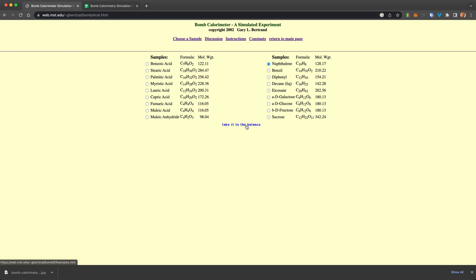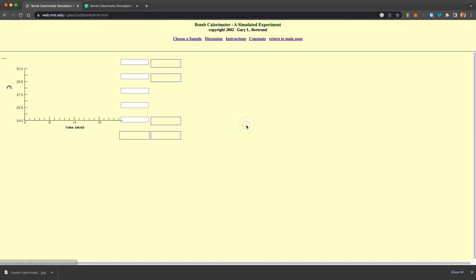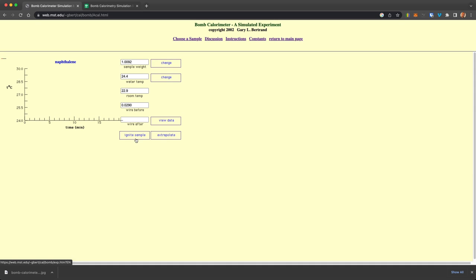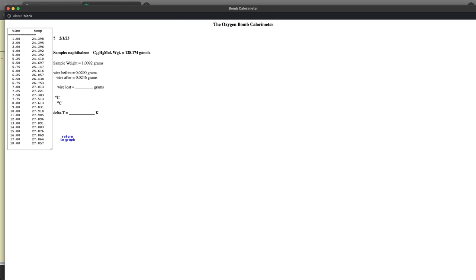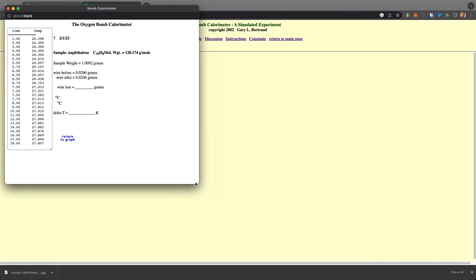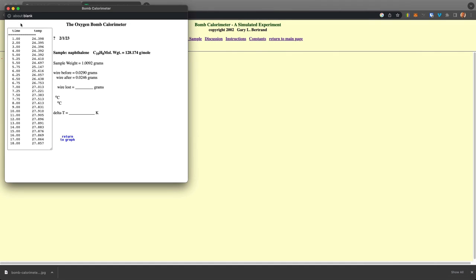And again, we could now take that to the balance, and we could use the parameters that comes or we could change those. And again, we can ignite that sample and get the data here where we could use that data. And this, again, as a function of time, and after you ignite it, you measure the temperature in increments.